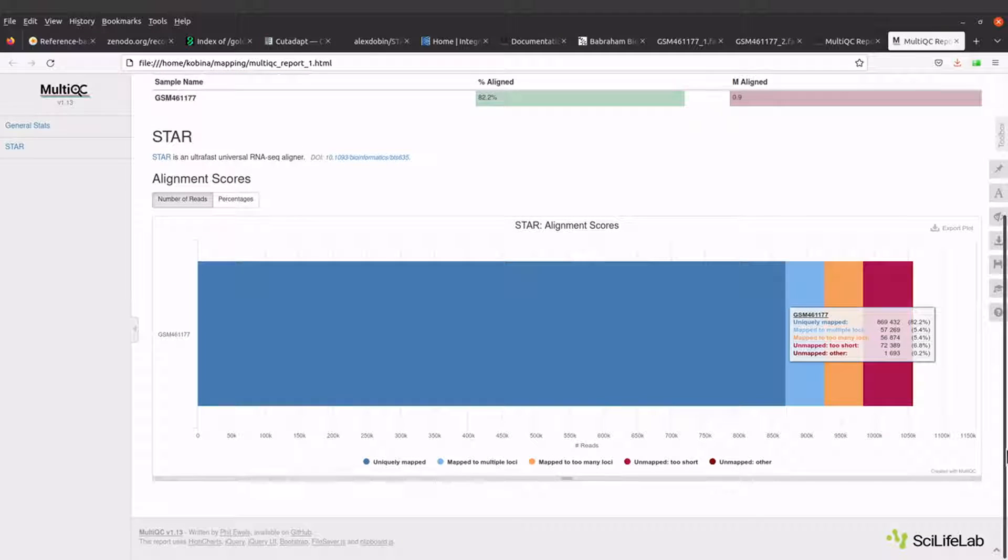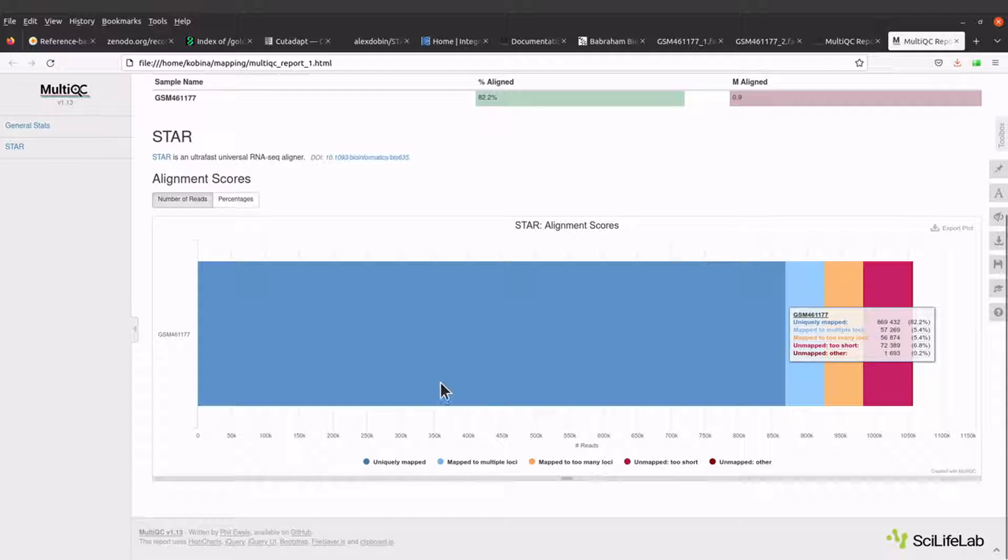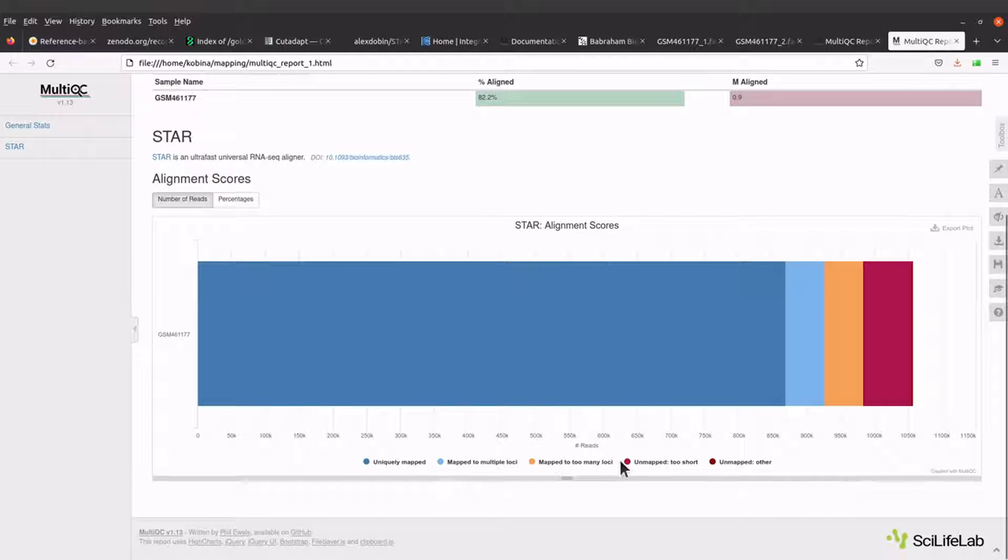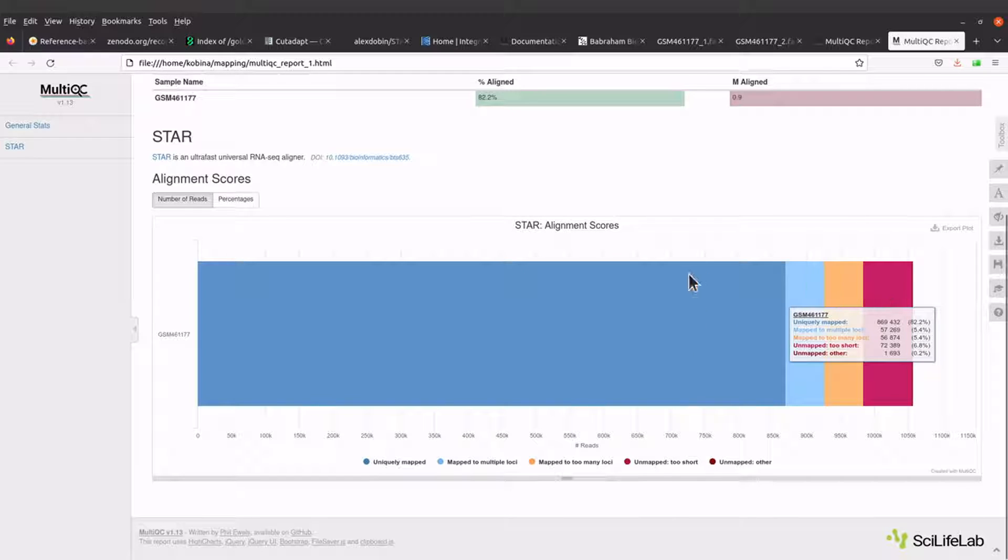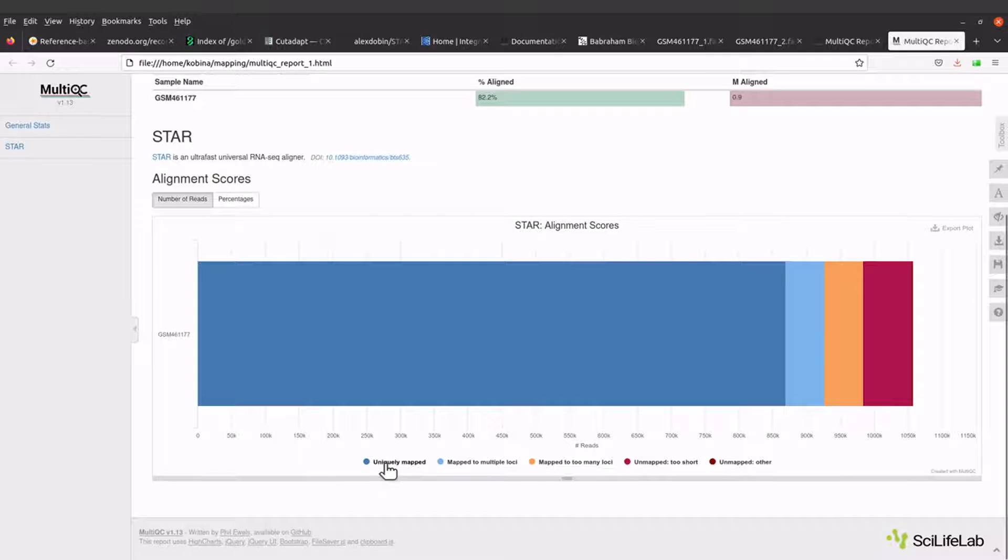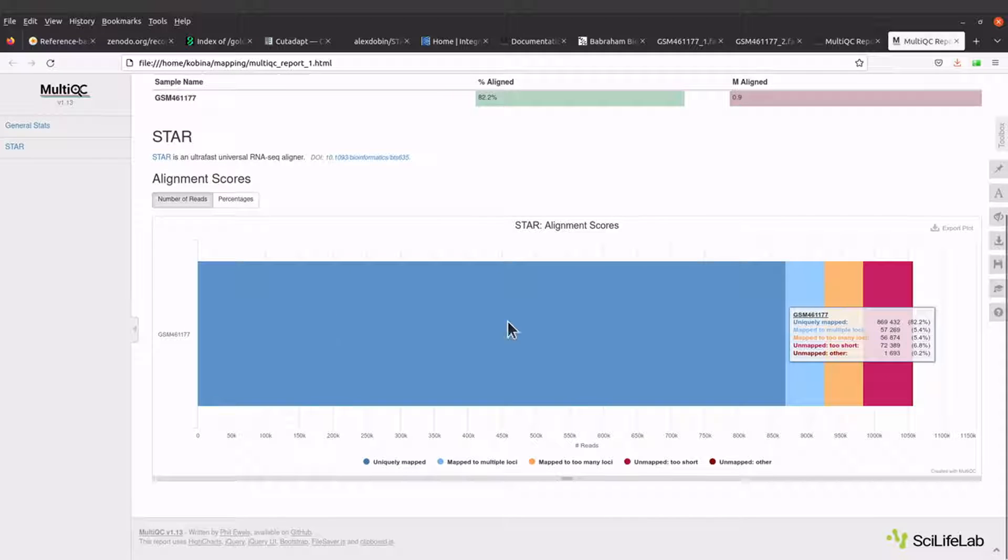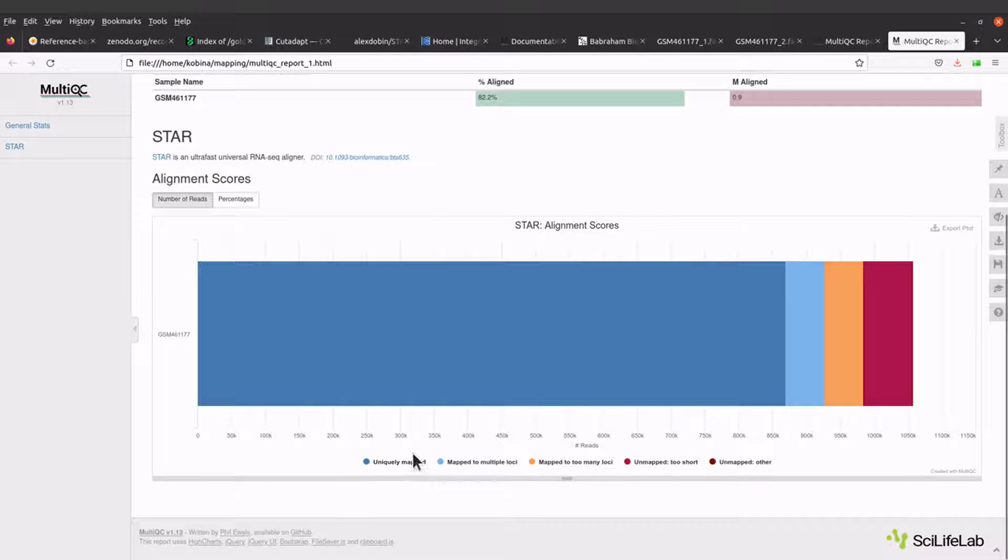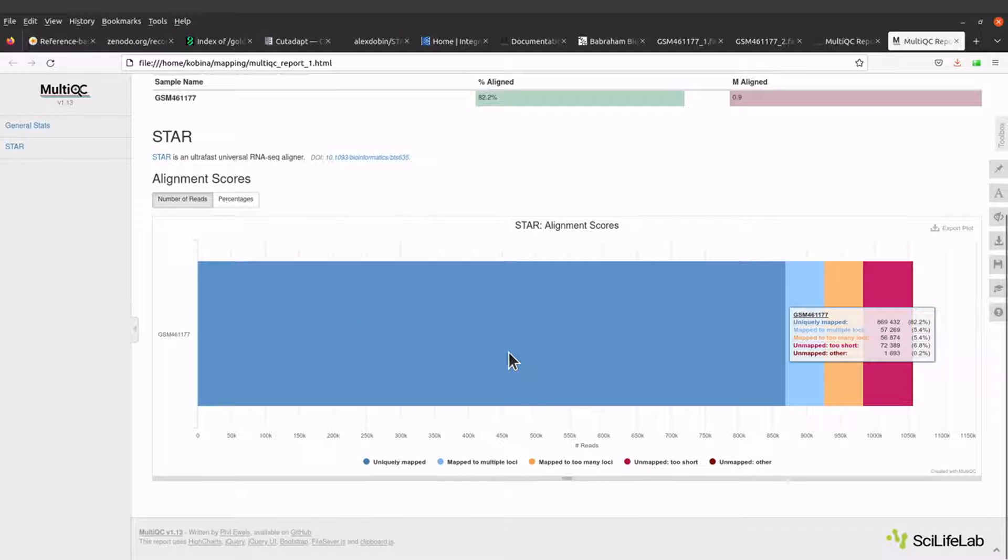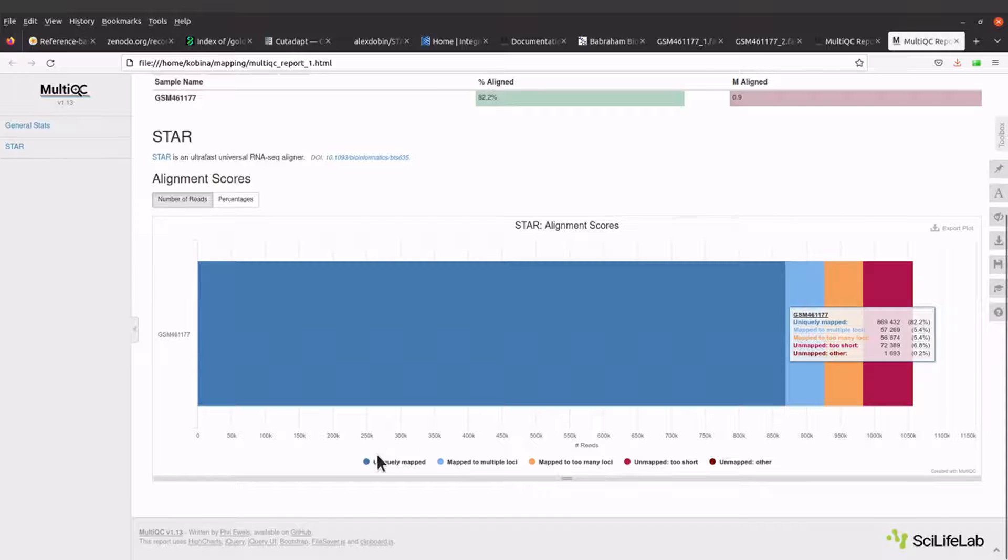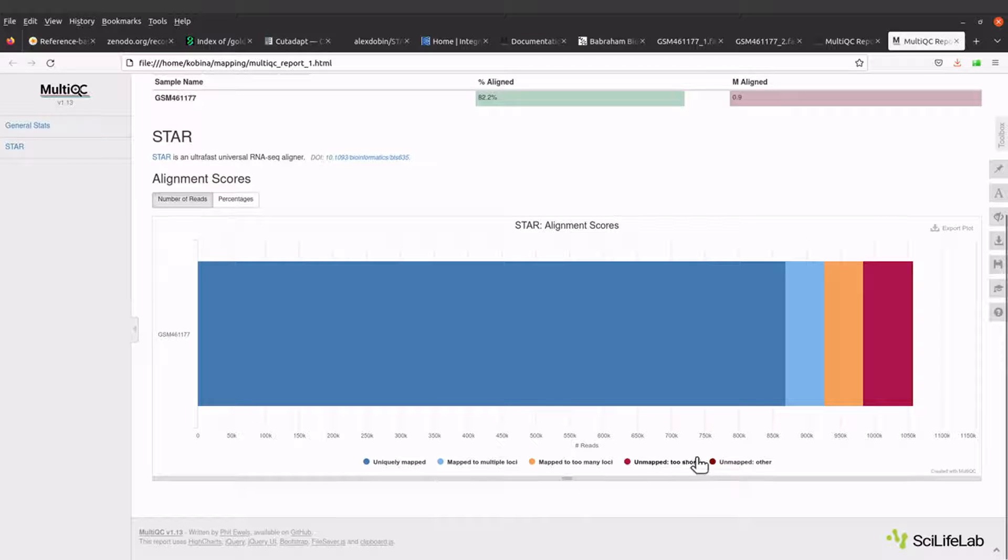So this is what we have. You can use the information here to interpret. Each color here represents a report and we have them here. So this color is for uniquely mapped reads and we can see that majority of the reads mapped uniquely to the reference sequence. We also have other ones here.